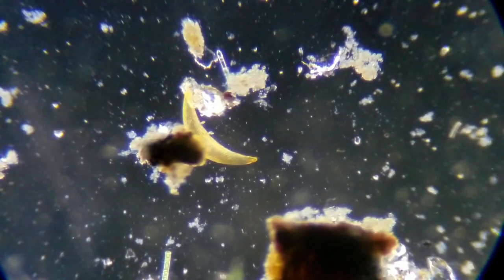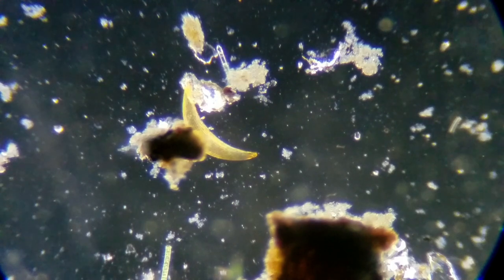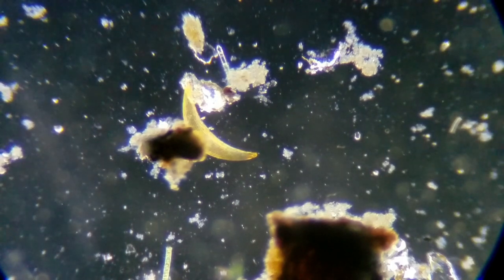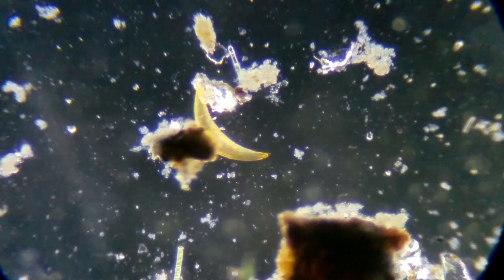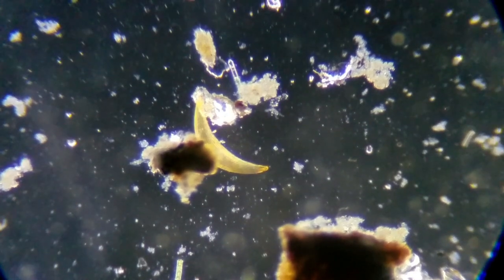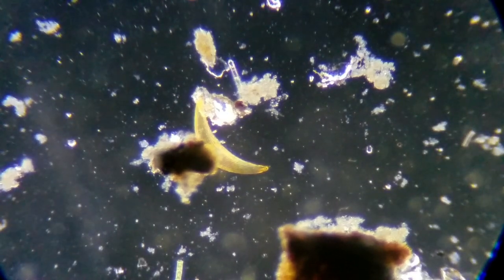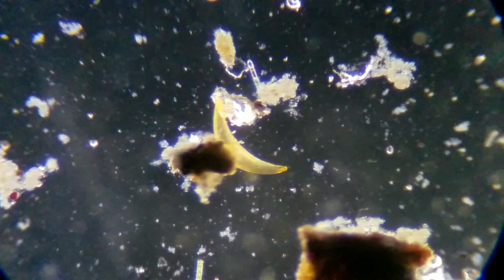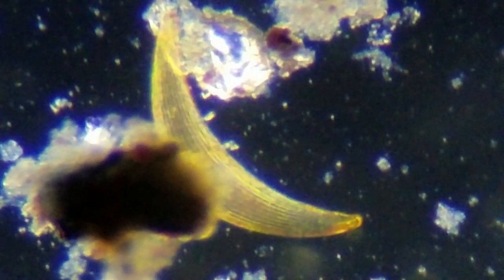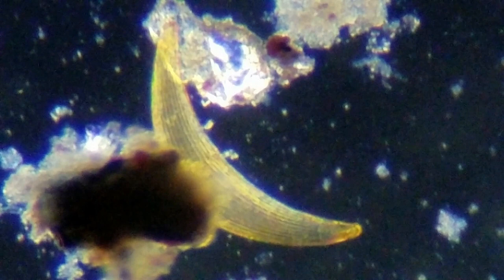Oh here's a pretty moon here. A beautiful moon — this is a type of diatom. Yellow. And I don't see yellow very often; I see green ones, I see different colors, but not yellow that often. Reminds me of an eighth of a moon when you look up in the sky. So this is just really pretty right here. We're looking at this at 100 power. I did a video on one of these a while back. See those straight lines going across there, like a banana. Silica trying to get in the picture here.